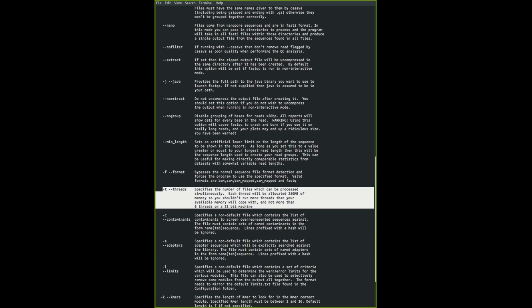If you have other computers, there is a way to check how many CPUs you have, and you can use a number of threads accordingly. So if you have 4 CPUs, the maximum that you can use is actually 8 threads. It's times 2 because, put simply, it comes as two threads per CPU.